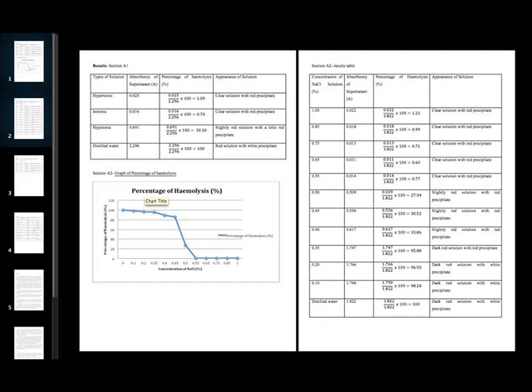For isotonic solution, the amount of solute inside and outside the erythrocytes is the same, so there will be no net movement of water into and out of the cell, hence no change in the shape, size, and content of the red cells. The supernatant appears clear and red precipitate is seen at the bottom of the test tube.